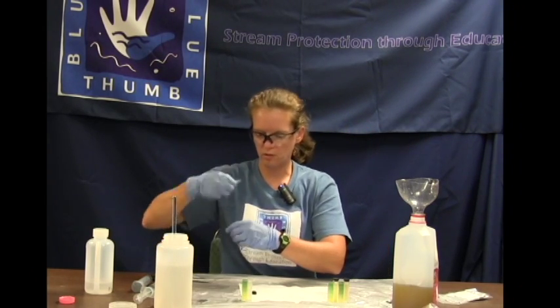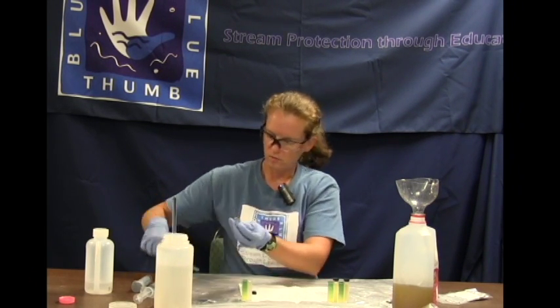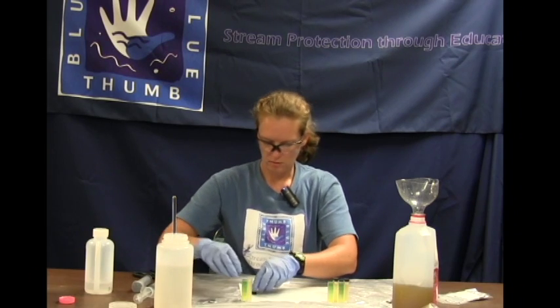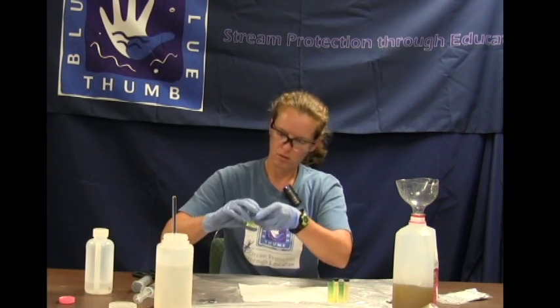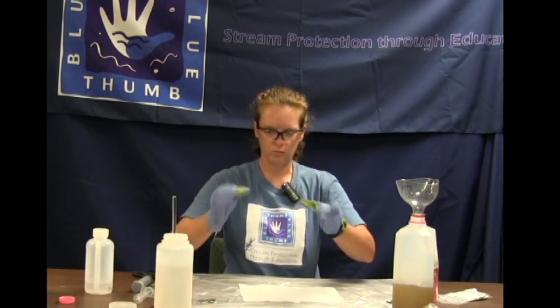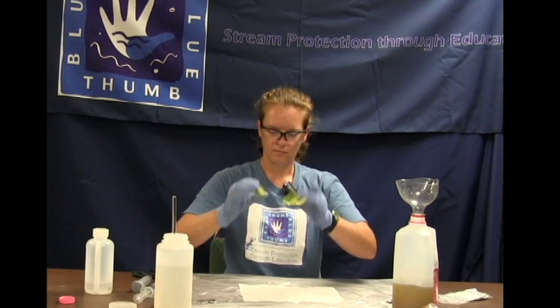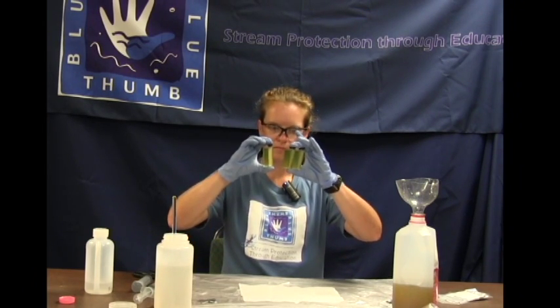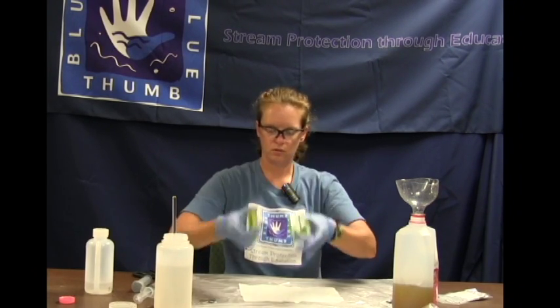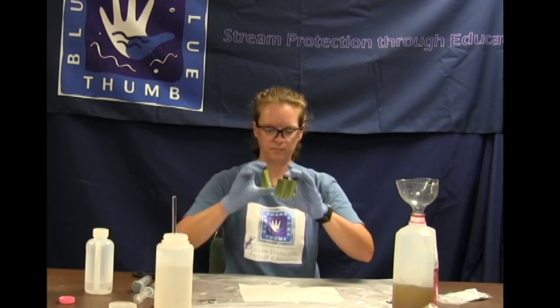Add the ammonia cyanurate also to the blank. The blank gets the same procedure. It's just filled with deionized water is the only difference. Get the lid on the blank, and again invert back and forth until that ammonia cyanurate is completely dissolved. So you do not want snow globes, no floating reagents in these cubes. They should all dissolve. It will take a little bit.